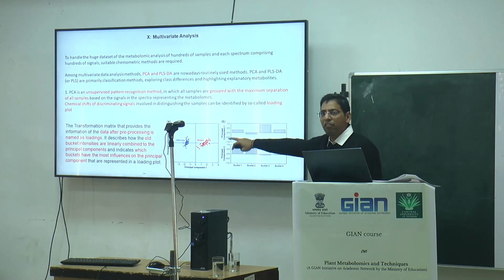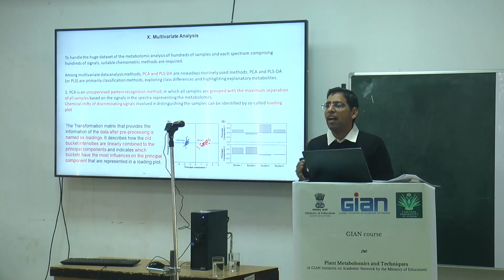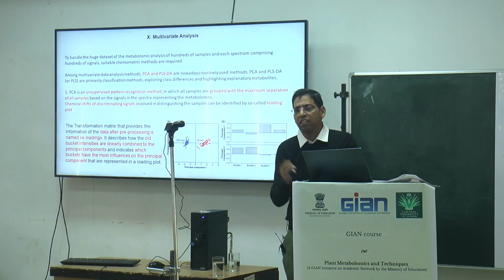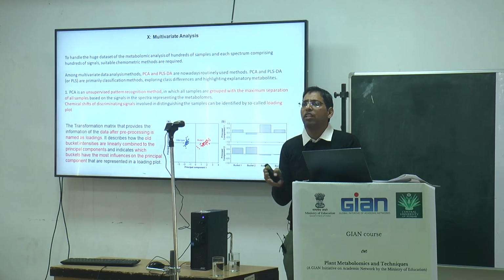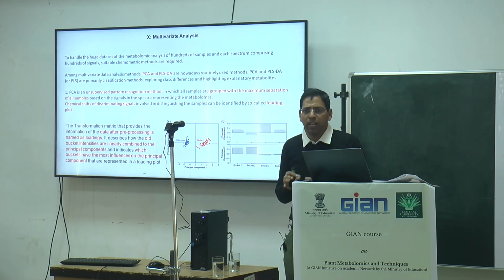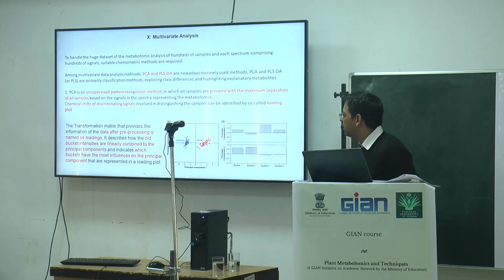This is the plot of two different variables with respect to each other. Suppose we have the data and we have so many variables: one variable with the second, with the third, one with the third. This way we have to do a series of principal component analyses. Then we have to find the pattern in between them. If we have two variables, then it's okay. Otherwise, we have to repeat this experiment again and again.